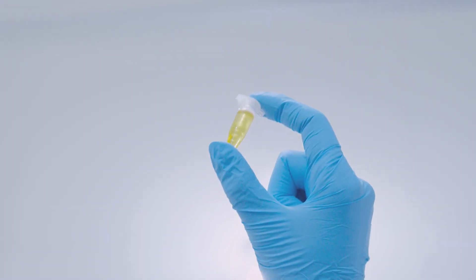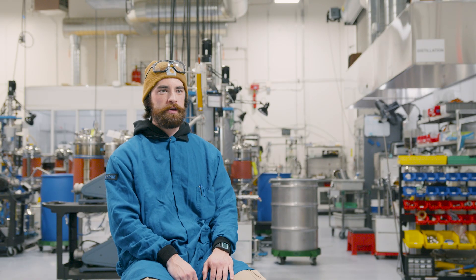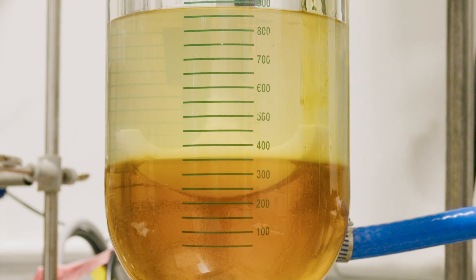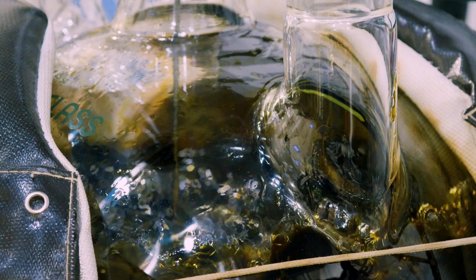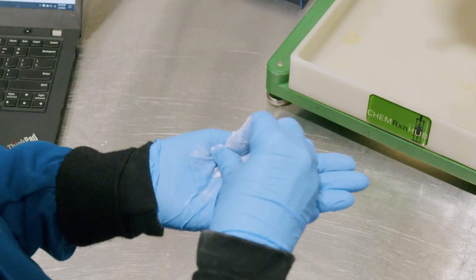Cannabinoid-rich distillates processed by this method are typically used for topical formulations, including our balms, creams, muscle gel, and so on. From there we can take the distillate and crystallize it into CBD isolate or CBG isolate, depending on what kind of hemp we're working with. So starting with crude extract, we are able to produce full-spectrum hemp extract, distillate, and isolates.